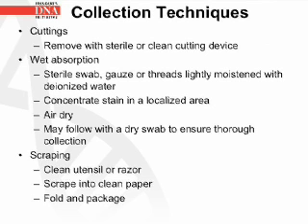Here are some common collection techniques. For cuttings, remove with a sterile or clean cutting device. For wet absorption, a sterile swab, gauze, or threads lightly moistened with deionized water could be used. This concentrates the stain in a localized area. It should be allowed to air dry, and you may follow with a dry swab to ensure thorough collection. For scraping, use a clean utensil or razor. Scrape onto a clean paper, fold, and package.